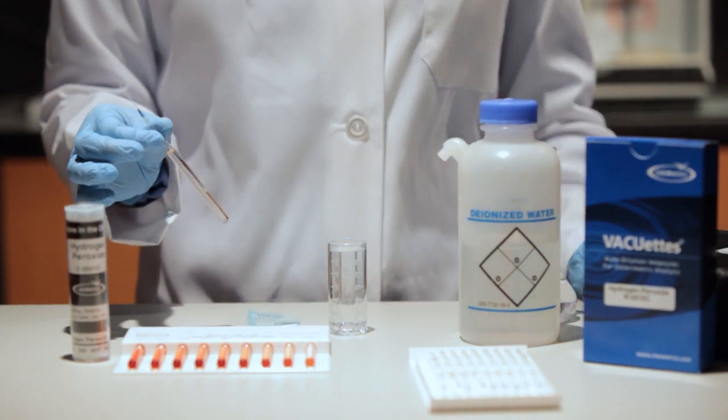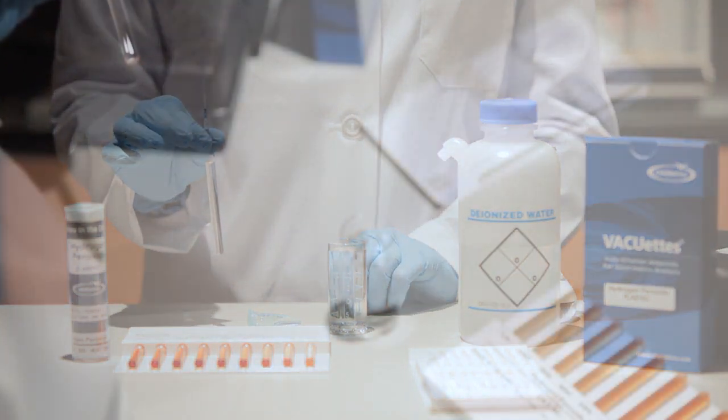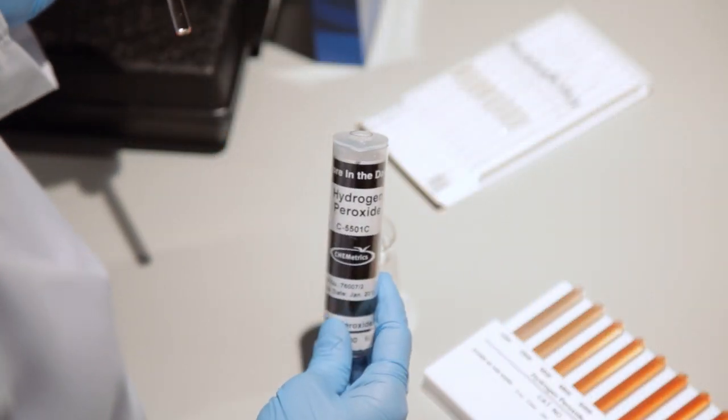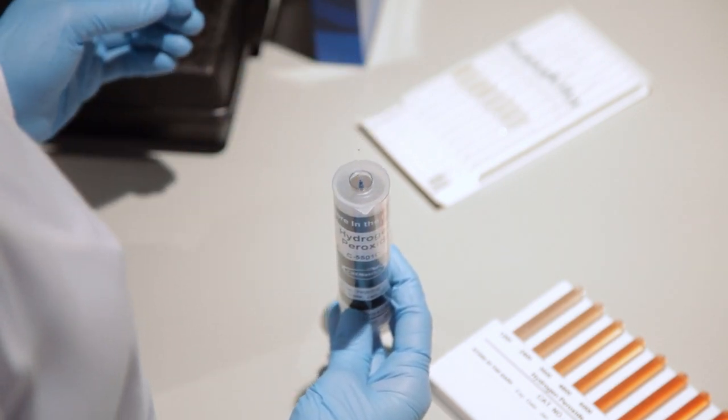The resulting color change can then be compared with the flat or round comparator to quantify results. For lower concentrations, use the round comparator by placing the ampule into the center tube of the comparator.